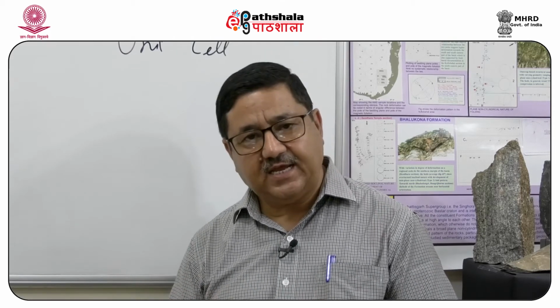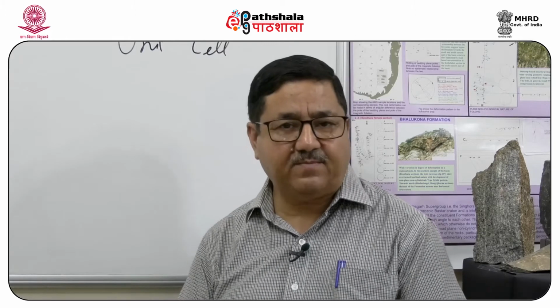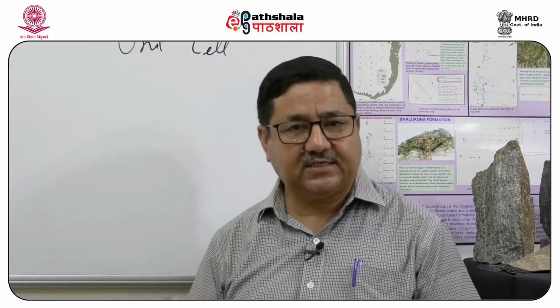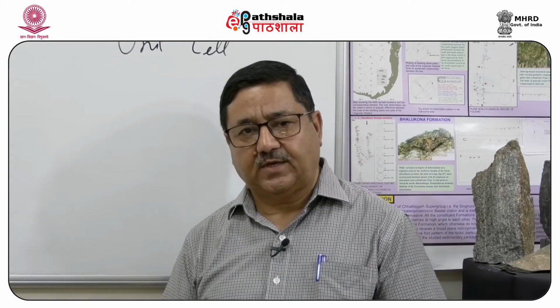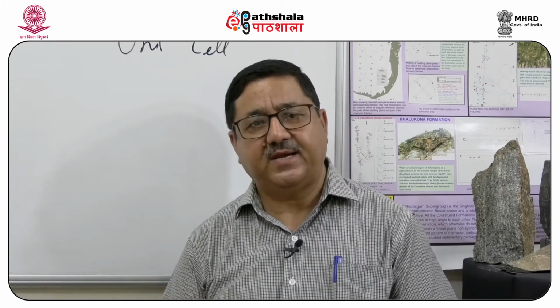A unit cell is a three-dimensional entity and it is defined by 6 parameters. These 6 parameters are the 3 axes of the unit cell and the 3 interaxial angles. So, if we can define and work out these 6 parameters, we can define the crystalline structure of a material.